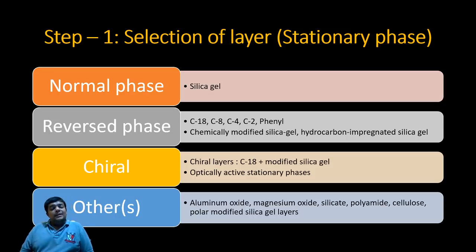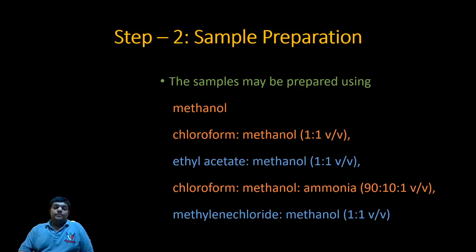So these are the different stationary phases from which you can select a stationary phase as that fine layer on the plate.